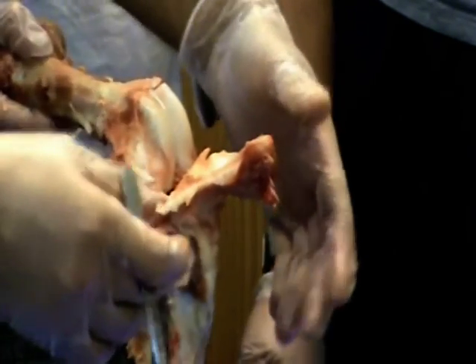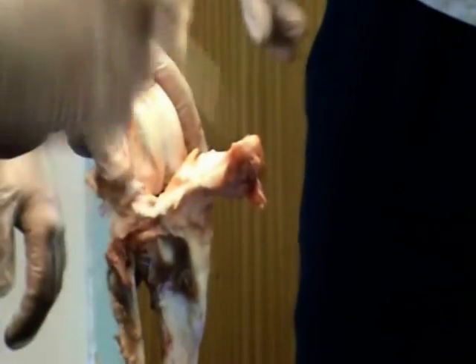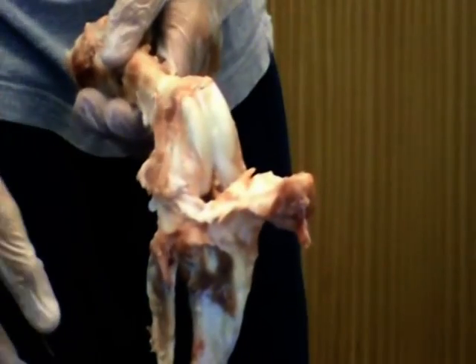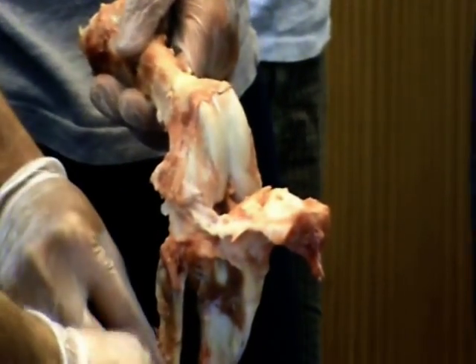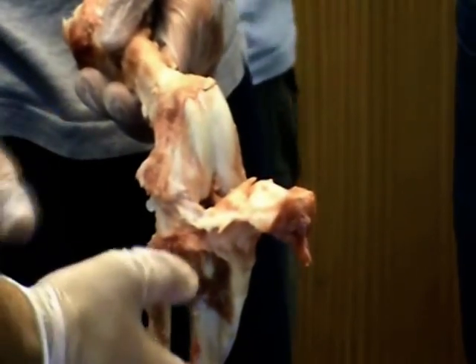I am happy. Okay, do you want to swap with someone else so you can go around that side? Do move around it, guys. You mentioned earlier that you can tell the outside of the actual leg because the fibula always points to the back.